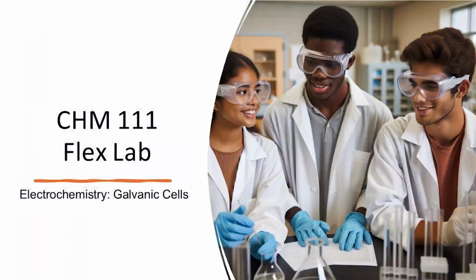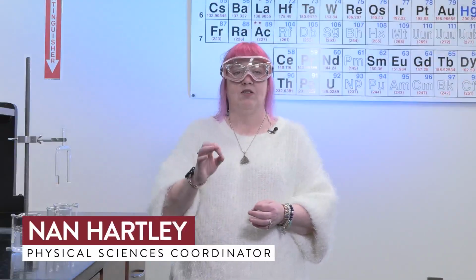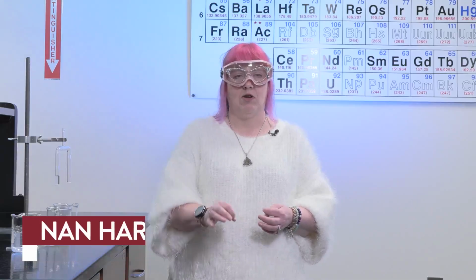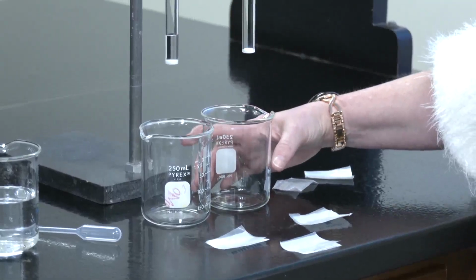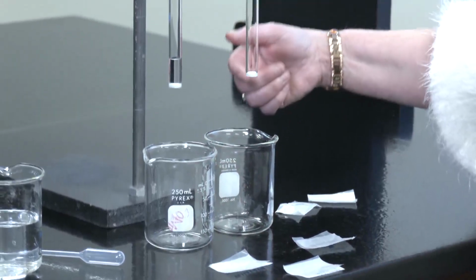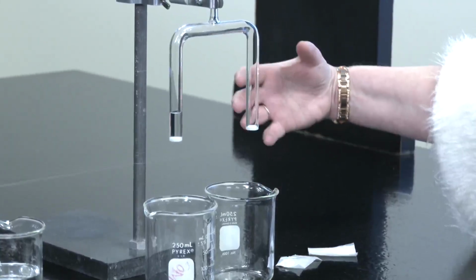So we're going to talk about the experimental setup for the galvanic cells experiment. Understand that I am only showing part of this. The rest of this you will need to figure out on your own. So there are other components to this setup that you will need to be working with. There are 2 electrodes that are going to go into this, and the 2 solutions that will need to be in here. Those electrodes will be connected to one of our voltmeters so that you can take that data.